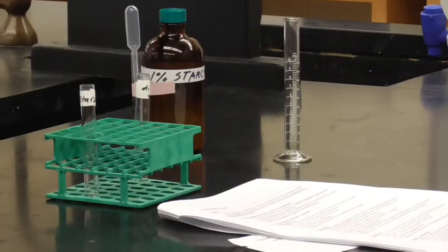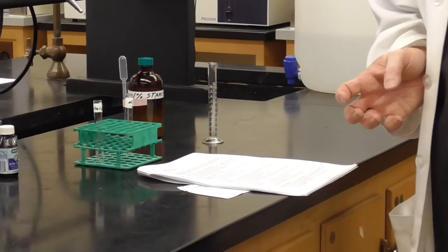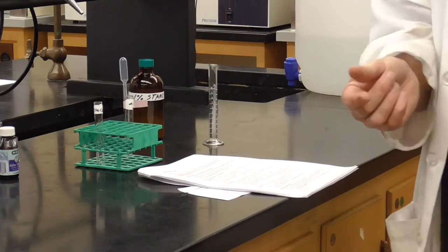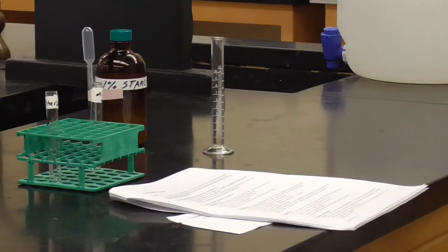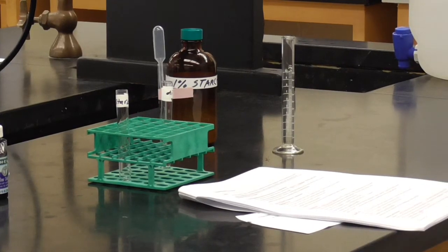Here's our third station. This one is to test for starch. Starch, like glucose, is also a carbohydrate. The difference is glucose is a simple monosaccharide. It's got one unit individually. And again, that's blood sugar. Well, starch is huge. Starch is a great big polysaccharide, a huge molecule. Starch is actually the way that plants store extra glucose for themselves, just the way that we store extra carbohydrates for ourselves. Of course, we do it in glycogen. Plants do it as starch.